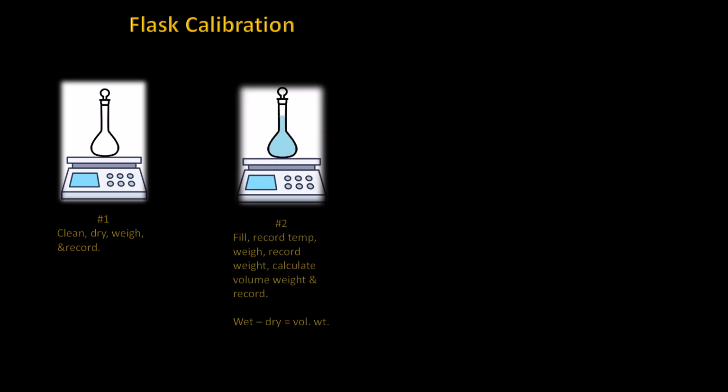Volumetric flasks, graduated cylinders, and beakers are the easiest to calibrate. There are 3 steps that are used to calibrate these containers. Calibrating a volumetric flask uses the same procedure as for calibrating the other 2. The first is to weigh a clean dry flask, then record the weight. The flask is then filled to the meniscus line, which would be the graduated volume mark on the flask.